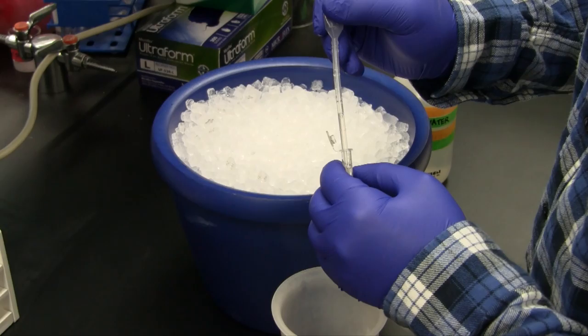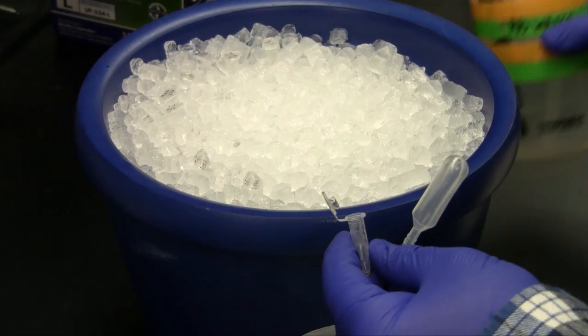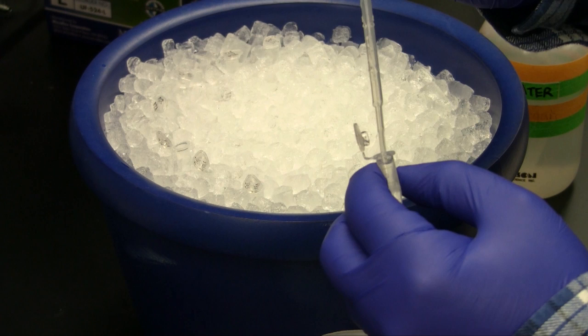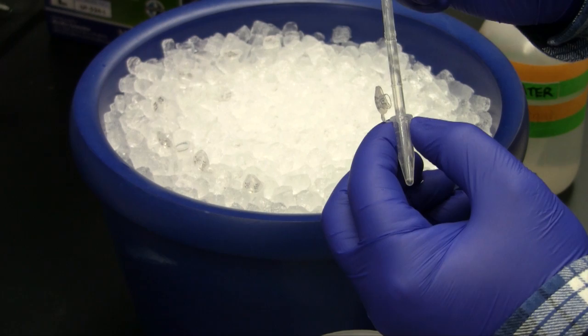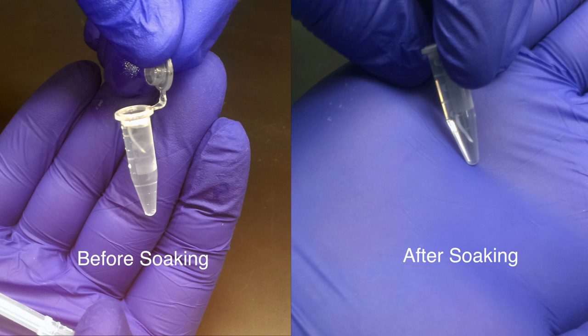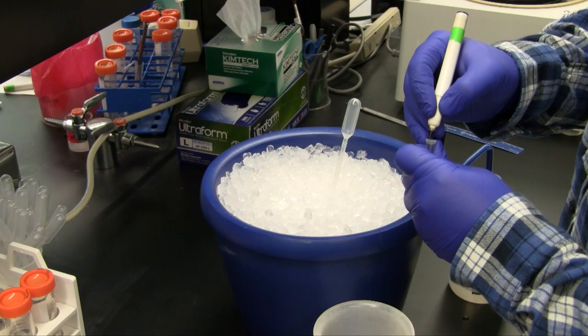Root tips must be digested to remove the cell walls and release the chromosomes from the cells. Root tips are first rehydrated in water or buffer for 10 to 30 minutes to remove the ethanol. The time used to soak is dependent on how long the roots were stored, with longer storage time requiring a longer rehydration time. The amount of time required for soaking can often be judged by observing the roots in solution. Once rehydrated, the roots will sink to the bottom of the tube. While the roots are soaking, tubes of enzyme are removed from the freezer and placed on ice to thaw.